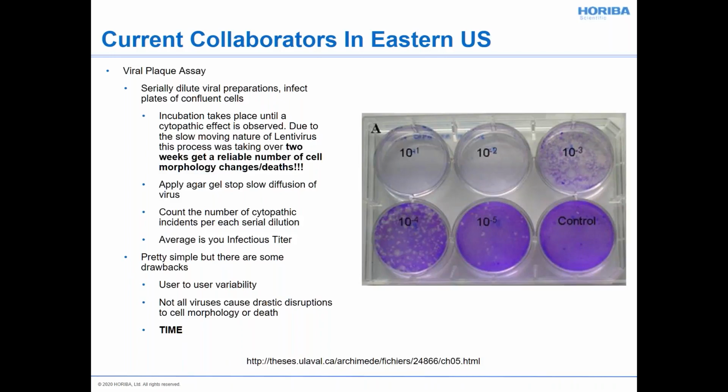All right, that all sounds great, except there's some user-to-user variability. The cells don't necessarily wave a little cross and say, hey, I'm dead. So people have to judge whether a cell has changed enough to be called infected or dead. And so that's an issue, because you and I might disagree on what is a weird-looking or dead-looking cell. And then it does take time. Someone's sitting there staring at a microscope.